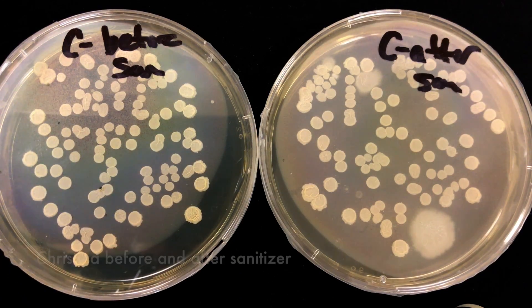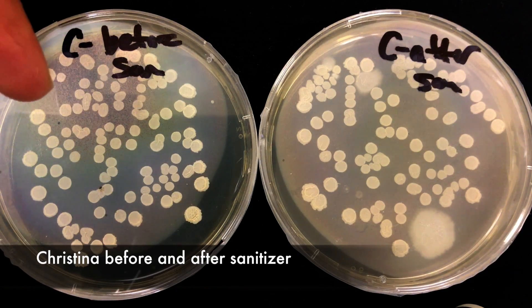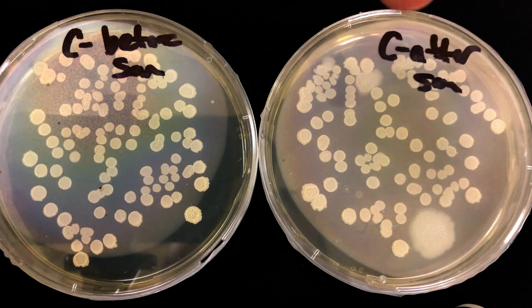Now, as a summary, this is Christina's sample before hand sanitizer, and this is the sample after she used the hand sanitizer. That was surprising and honestly a little bit gross. I know hand sanitizer, like I said in the beginning, is better than doing nothing at all. But I think myself and definitely the employees here are going to be relying on washing their hands more, taking more trips to the sink, and throwing those hand sanitizers to the side. Thank you guys for watching. If you have any suggestions for future experiments, let me know. This was a fun one, a gross one, but a fun one.